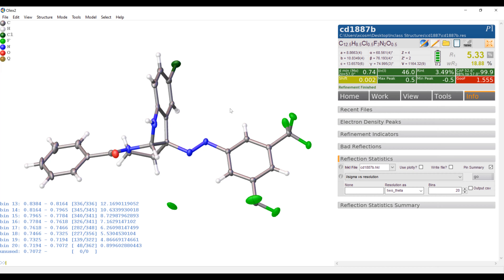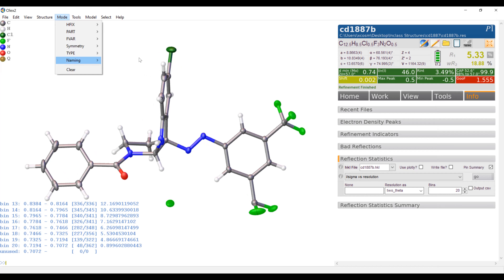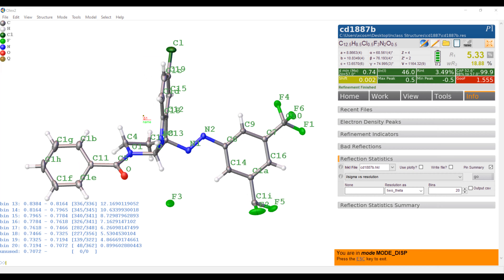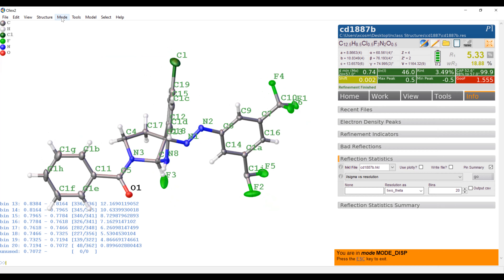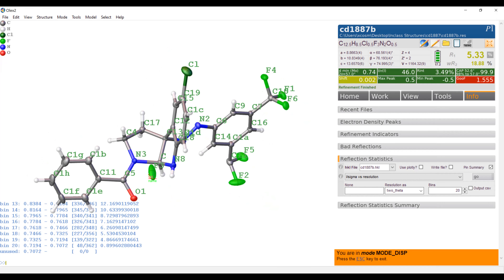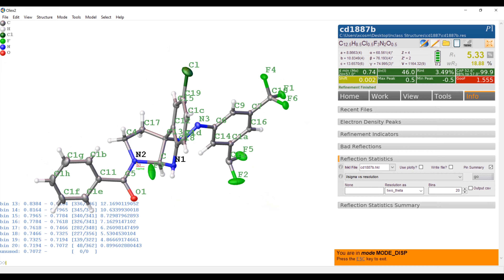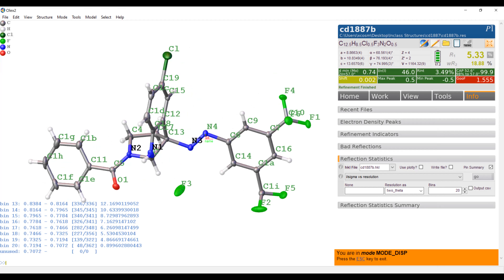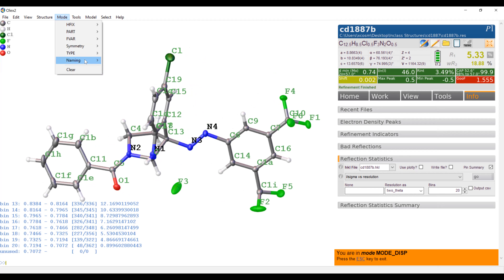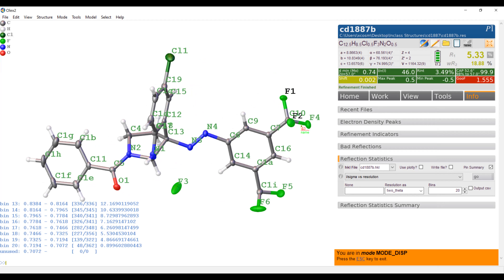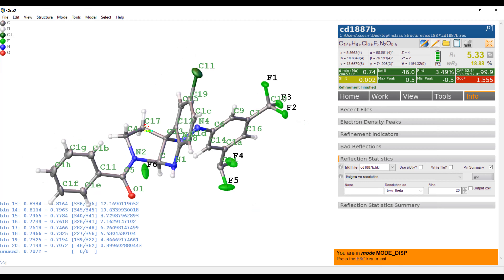Another thing you can do is label the atoms. I go to mode naming and do this for each atom type. Click start on the oxygens — we do O1. Then we do the nitrogens: N1, N2, N3, N4. Let's do the chlorines. And now we'll do the carbons.